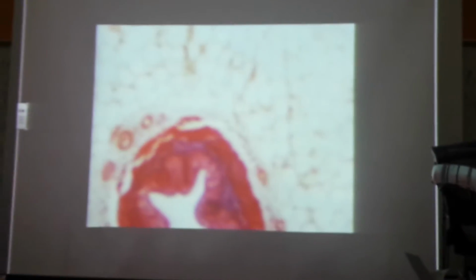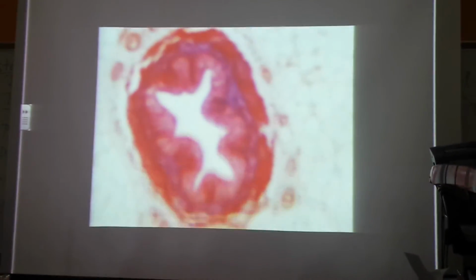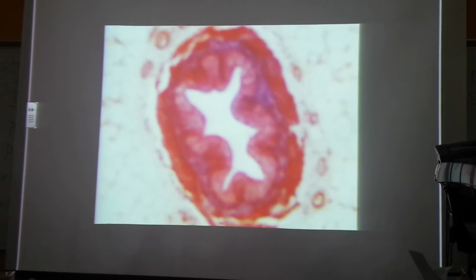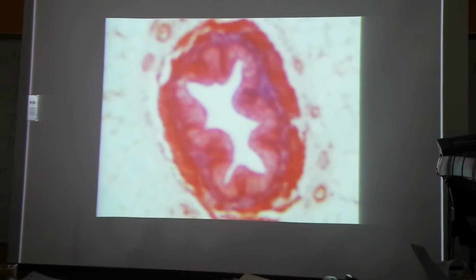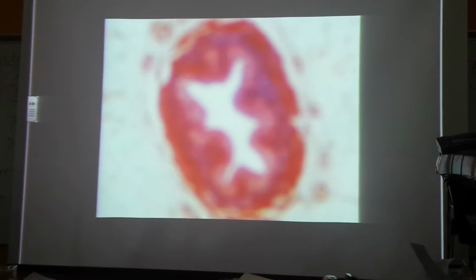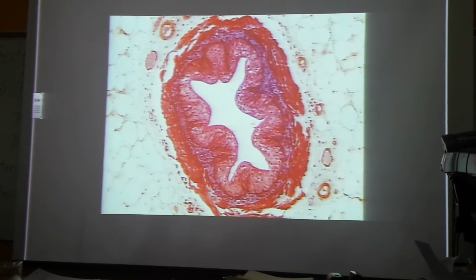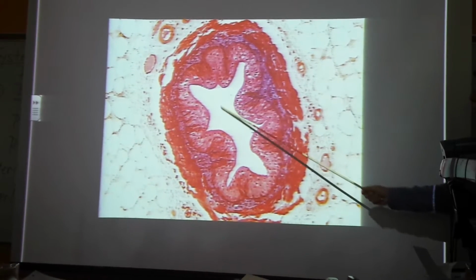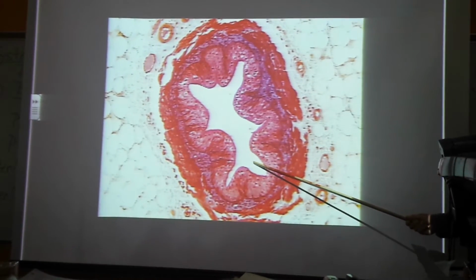This is the tube that carries the urine from the kidneys to the urinary bladder. Usually one is associated with each kidney. I'd like you to know the layers of the wall. Right, first off, here's the lumen where the urine would pass.